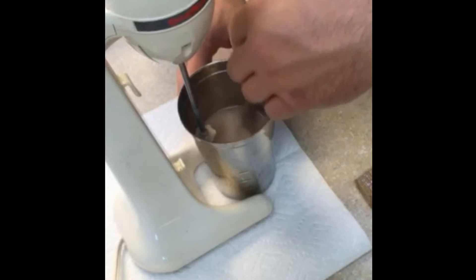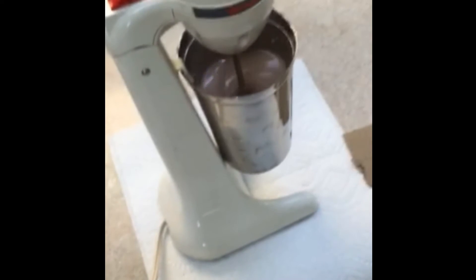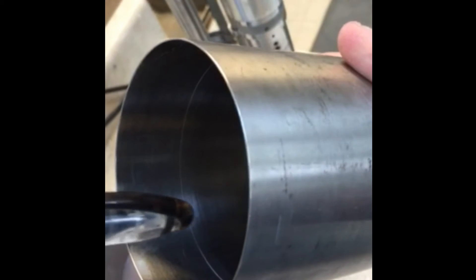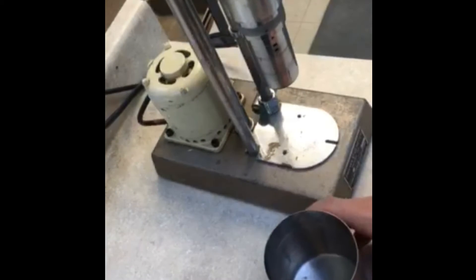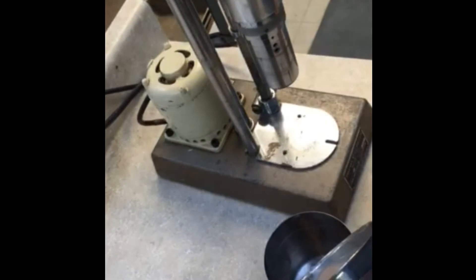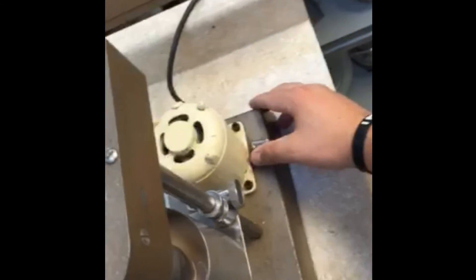Some of it tends to stick to the side, so you scrape the side off and then start the mixer back up again and mix for a certain amount of time to make sure that the bentonite is thoroughly blended into the water. The big thing is we want to test the viscosity of the bentonite-water mixture suspension.